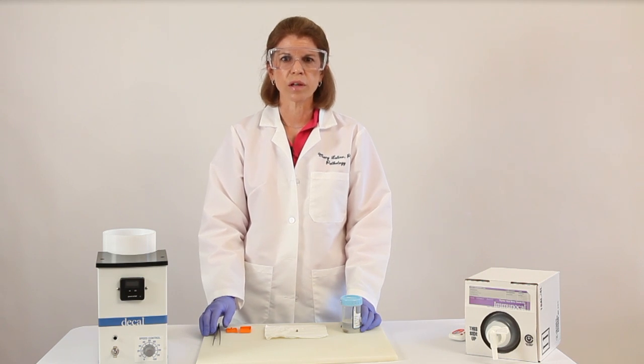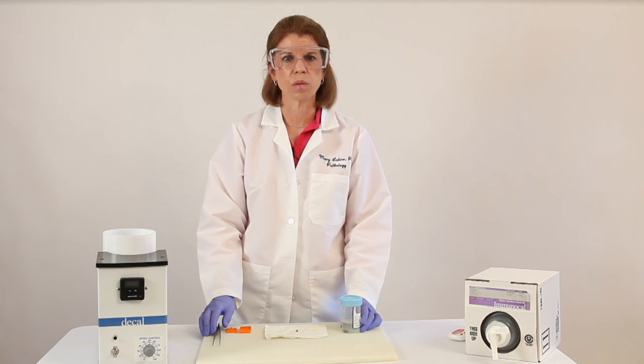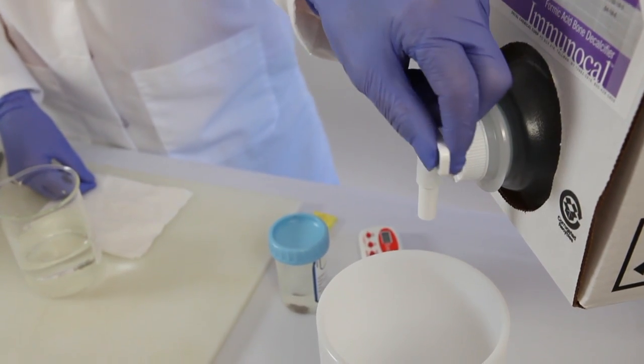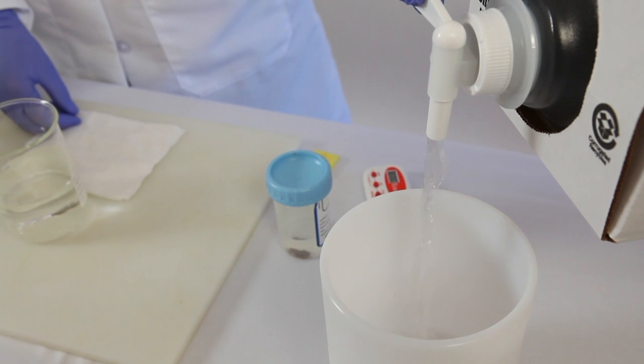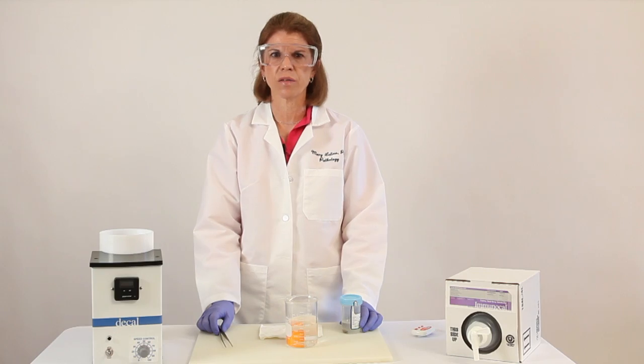So start by pouring your decalcifying solution into a beaker. I use Immunocal from Decal for bone cores. In addition to having these little cubitainers that are easy to pour, it's a very mild formic acid decalcifier.